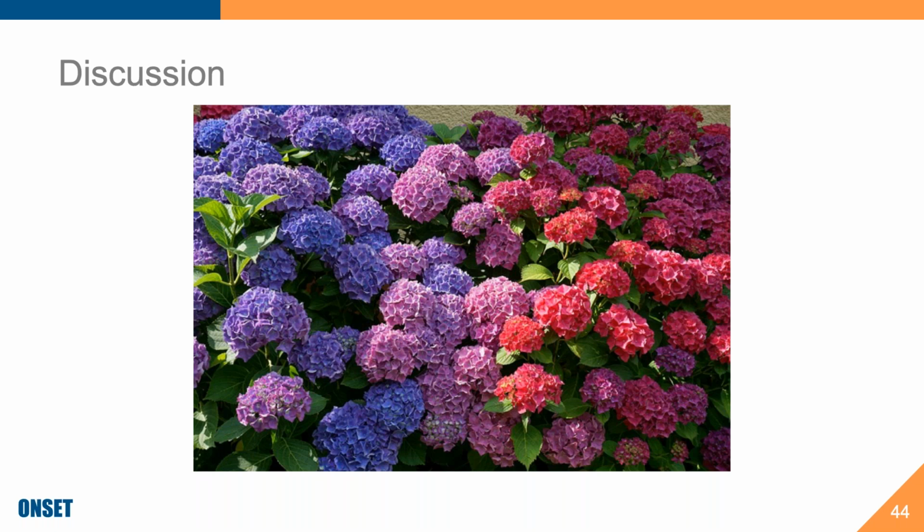Okay, let's see. Someone asked about a pressure component. There isn't a pressure component. It's the gas, that's probably grabbed up in the gas constant. So that's where I would expect to see in the Nernst equation any effects of pressure. But also temperature plays into that. So the higher the temp, that's why temperature is also important, because you are looking at the thermodynamics of a solution. So pressure does matter, and that's why also altitude will be important too.